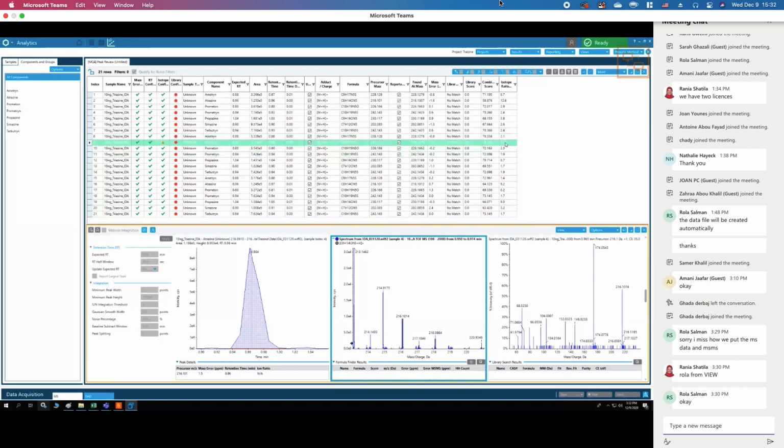And you see we set the percentage to be yellow at 15. So that's why we have 1 yellow mark there, because this is borderline acceptance. Don't forget, I set that up. I didn't know that 15 was going to be like that, but that's a good case of where you would perhaps like to adjust that for your own flexibility, if you want to flag something like this or if you want to accept something like this.